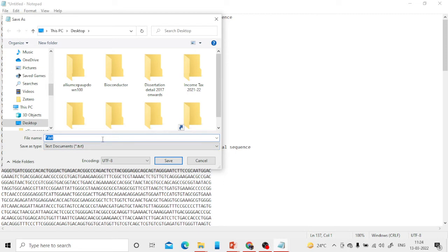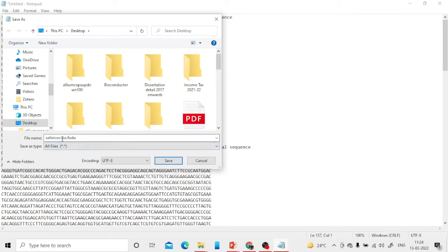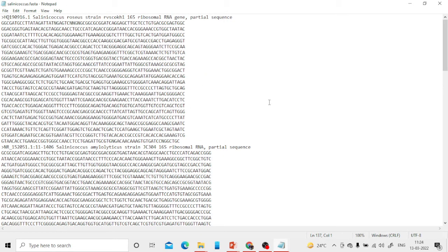Save the file in FASTA format — for example, I'm naming it 'salini'. The important thing is to add the extension '.fasta'. If you don't add that extension, the software will have trouble. Also, make sure to select 'All Files' in the file type dropdown. The file name is flexible, but the '.fasta' extension is compulsory.